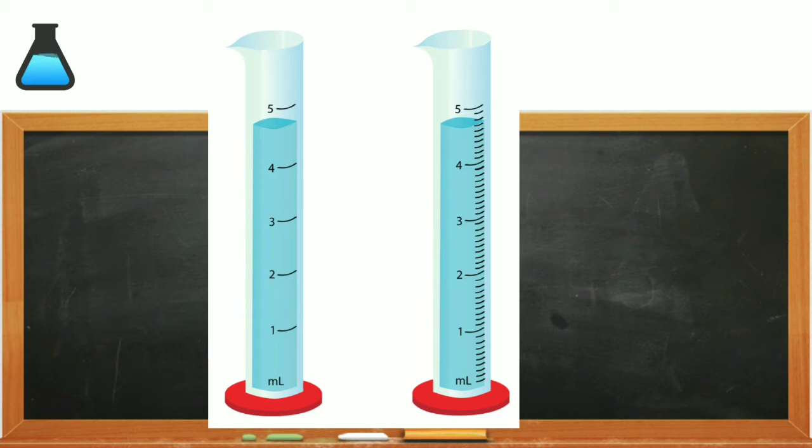Okay, so let's practice measuring one place beyond with several instruments. So here we have the volumetric instruments called graduated cylinders. Recall that when you read a measurement from a graduated cylinder, you always want to read from the bottom of the meniscus, that sloping region. So we can see that the graduated cylinder on the left has fewer divisions. So its measurement, I'm going to estimate to be approximately 4.7 milliliters of liquid there.